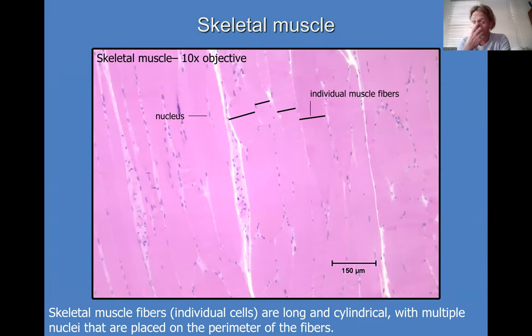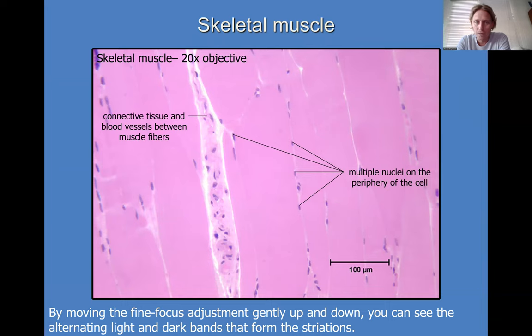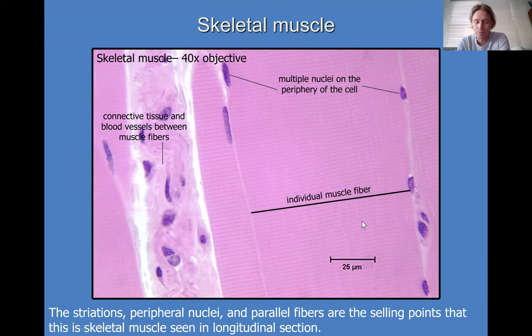Here's another slide of skeletal muscle to give you variation on what you might see. When you first put the slide under the microscope, you may notice connective tissue or scar tissue associated with the muscle tissue. Here is the muscle tissue, and you can see the individual muscle fibers or muscle cells. When you get a higher objective lens, the nuclei become more apparent — multiple nuclei because they're multinucleated, all pushed off to the sarcolemma. When you zoom all the way in, you'll see those striations, the chains of contractile proteins.